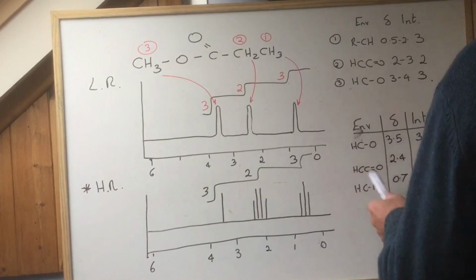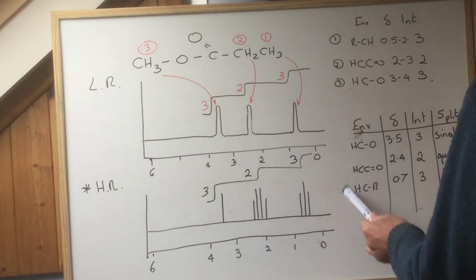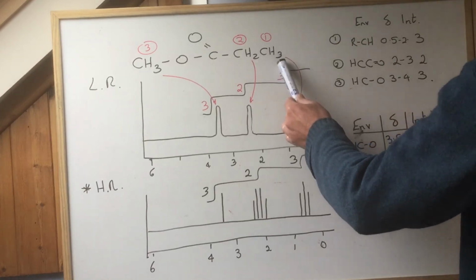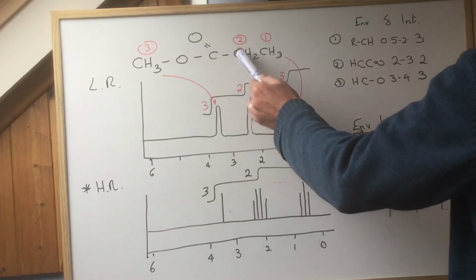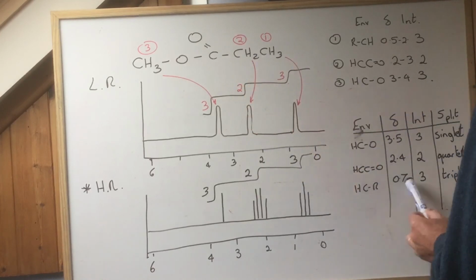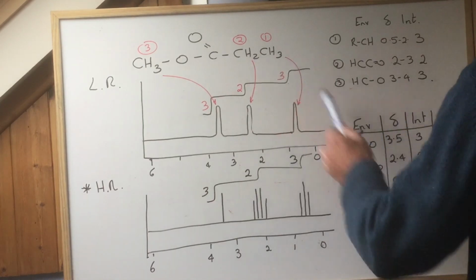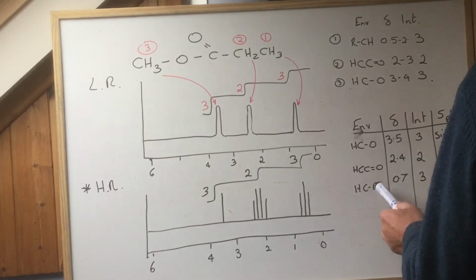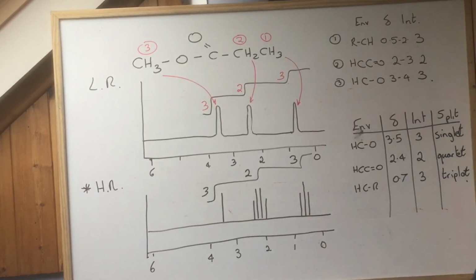Then I look at the other one. Bearing that in mind, these 2 go together, because then I'm looking at my H is on my methyl group right at the end, protons on the methyl group. Everything matches, and if the one next to it has 2 protons, I'd expect this one to be split into 3, because there's 2 on that one, so they're talking to each other. They're mutually dependent on each other, these values, and they have been split into 3, triplet.